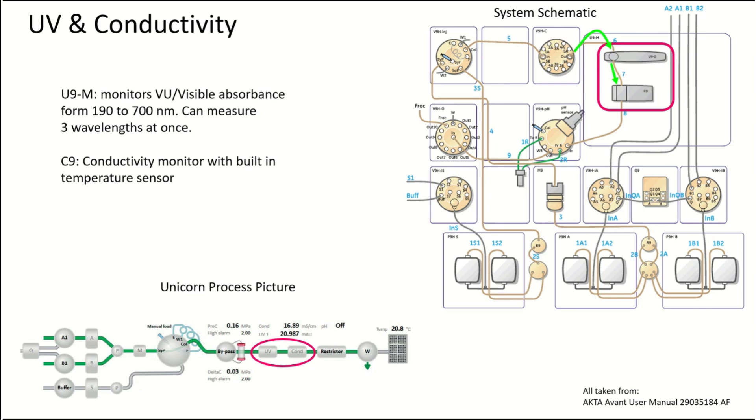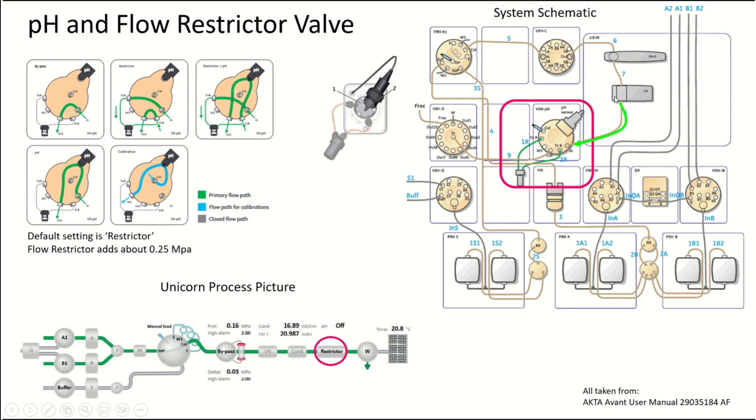The conductivity monitor has a built-in temperature sensor and is right after the UV monitor. After that, we have a pH and flow restrictor valve, which is very convenient. Its default position is with the restrictor on and the pH sensor off. The flow restrictor adds about 0.25 megapascals, and this depends on the type of chromatography you're doing, the flow rate you're running at, and if you have an Avant 150 or a 25.